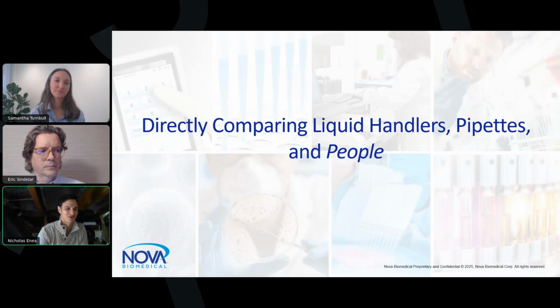because anything that gets to a liquid handler starts off at the bench, right? As a lab scientist for a long time, there's always this war between the automation engineer and the bench scientist. I would transfer it over to the automation engineer, and if it didn't work, I would ultimately blame the automation engineer. But really, I could have been wrong with the transfer steps as a bench scientist as well. So let's talk about it and delve into that a little bit more.